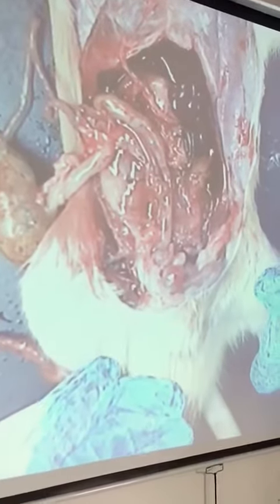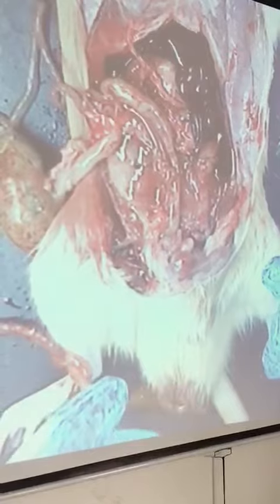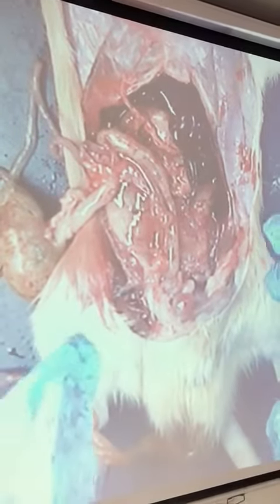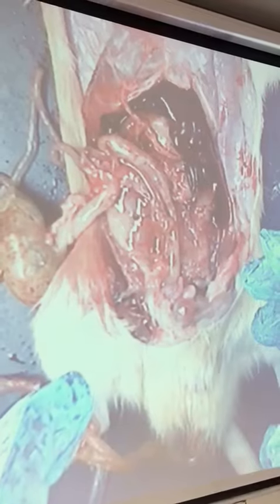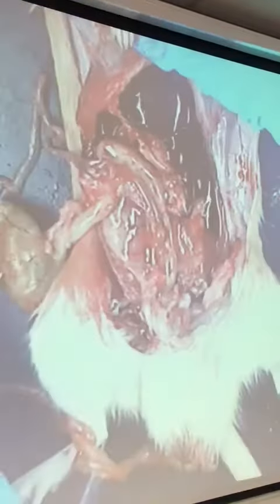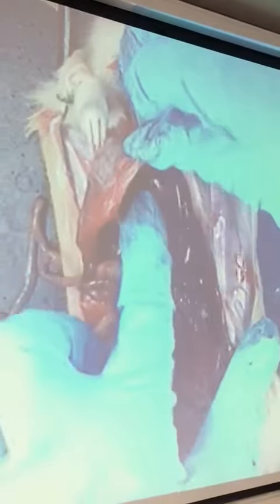When we look at the abdominal cavity and the thoracic cavity, it is separated by the diaphragm. The diaphragm is important because it separates between layers as well. The diaphragm separates the abdominal cavity from the thoracic cavity. Here, that's the diaphragm.